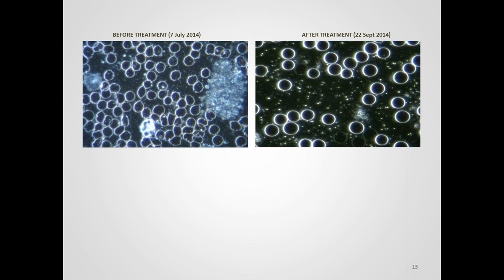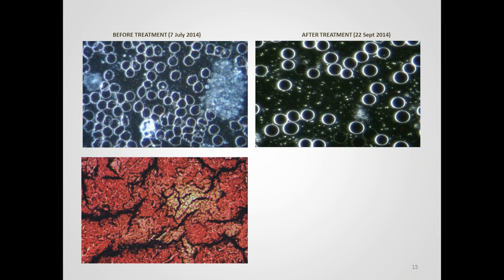And then the light grey structure towards the right-hand side on that image on the left is again a group of thrombocytes. This is just again with a dark field. And this is then from a dry blood sample. And what we're looking at here is actually that lighter area that's visible towards the center with those black lines that are in a sort of broken up pattern in the middle there.